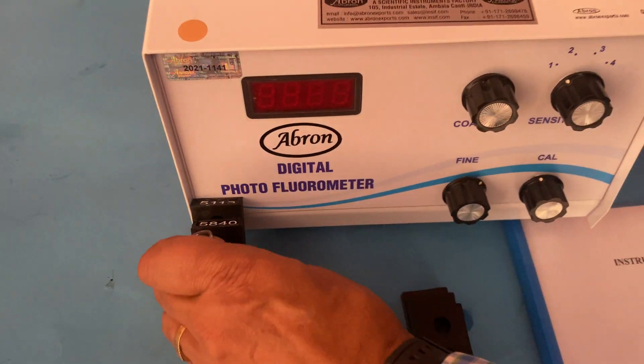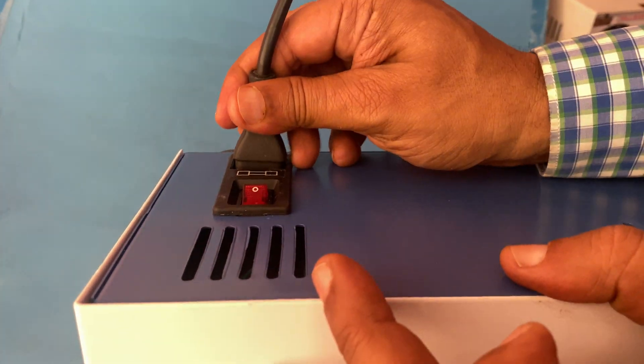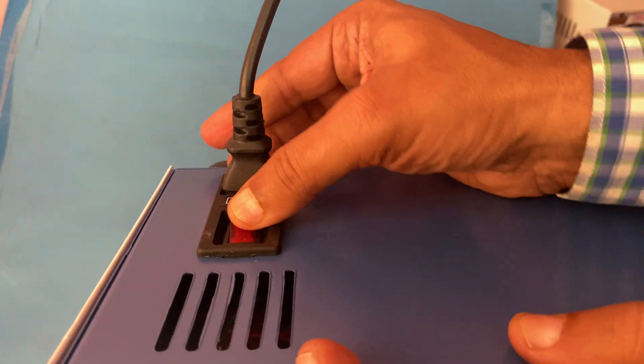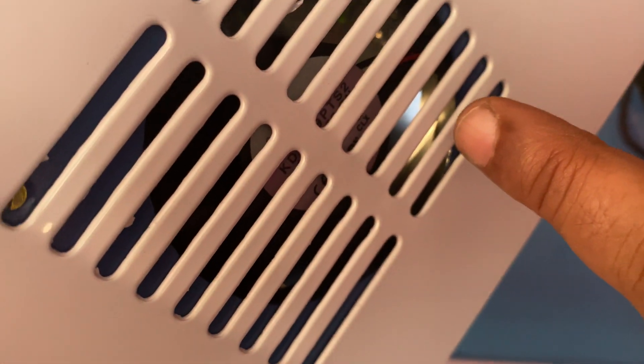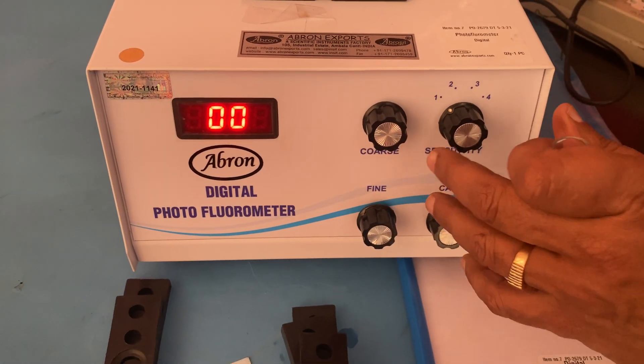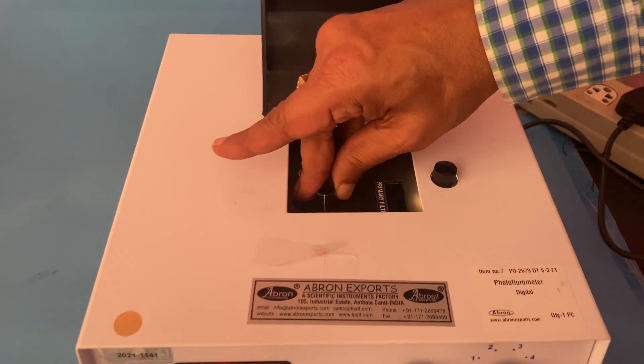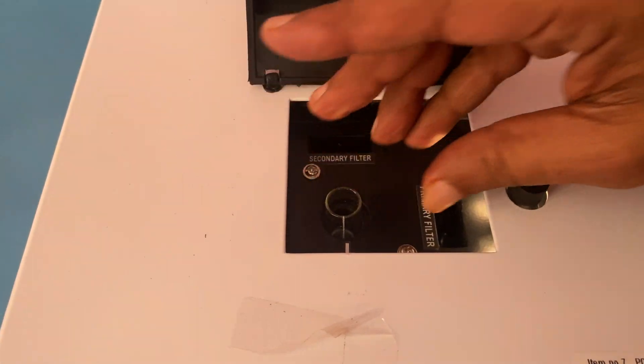These are primary filters and these are secondary filters. Let me show you the working. First of all, we connect the power supply here and switch it on. When you switch on, the fan is running — you can hear it, only a very little sound. Now I put in one blank sample with the matching line.